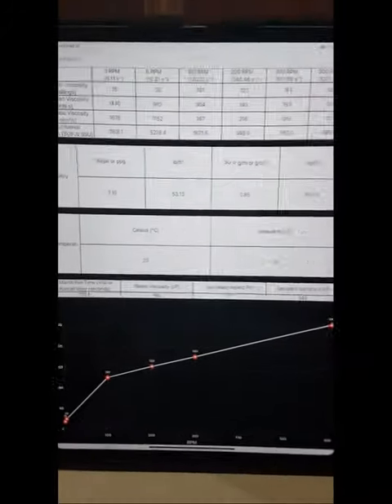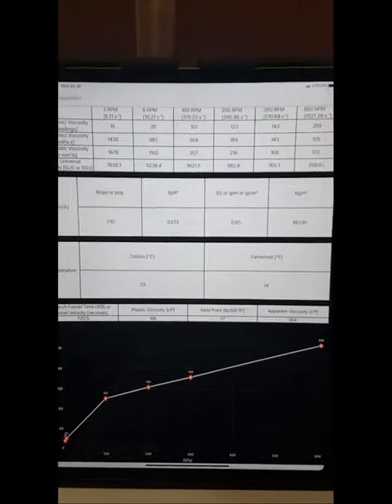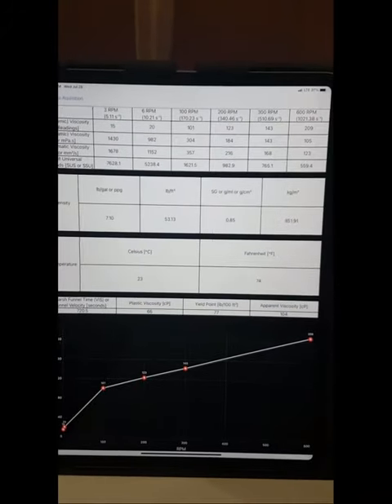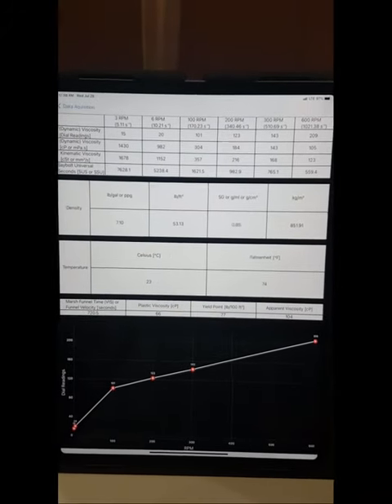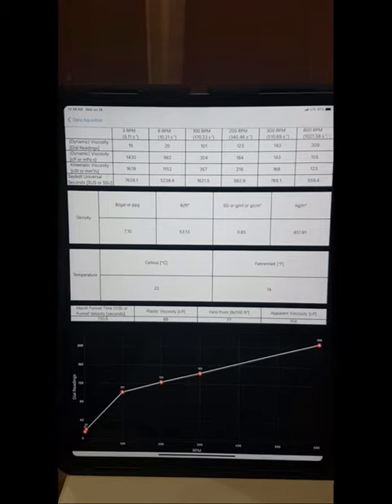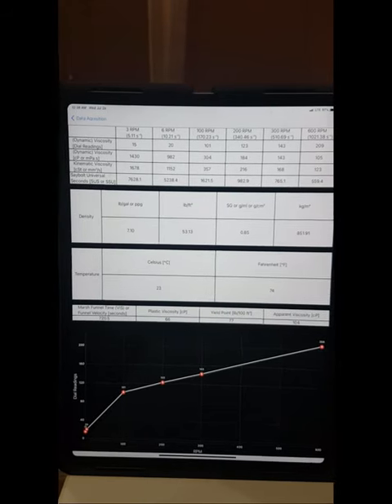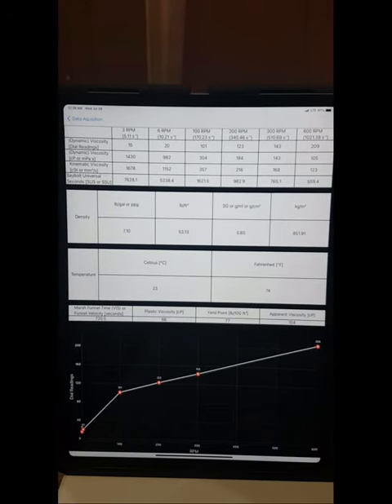There also exists a version of the Goblet Viscometer for automatically regulating the temperature at which the fluids are tested.